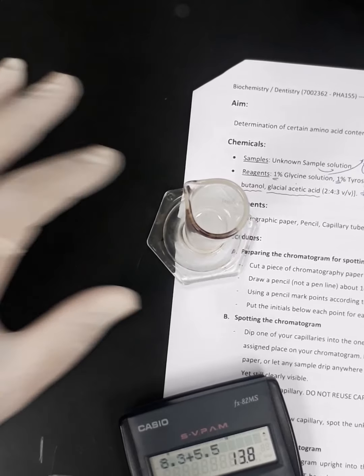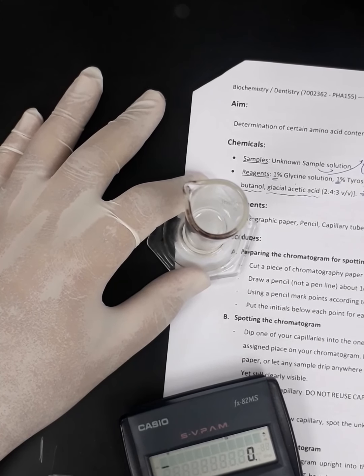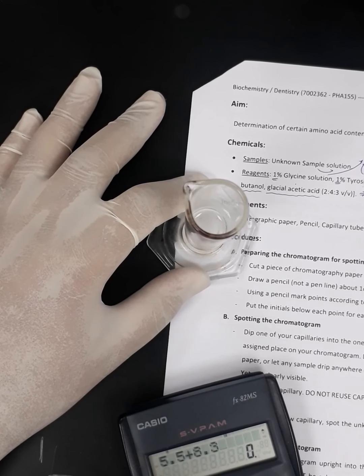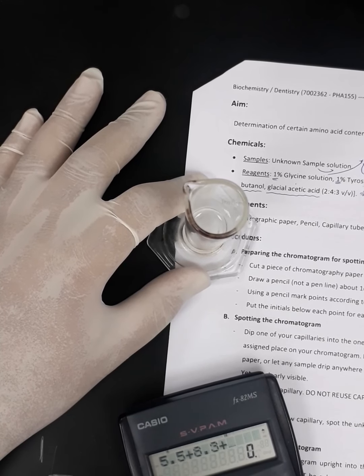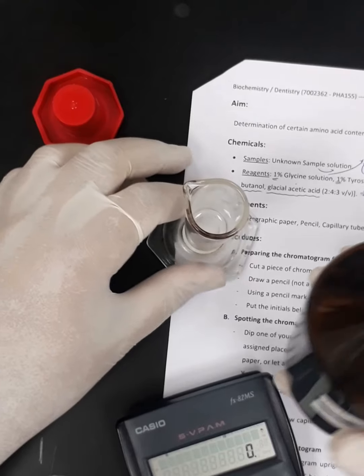Now we are going to add the N-butanol, 11.11 milliliter. So we have to add that to 5.5 plus 8.3 plus 11.11. So we are going to go to the mark of 25 using the N-butanol.